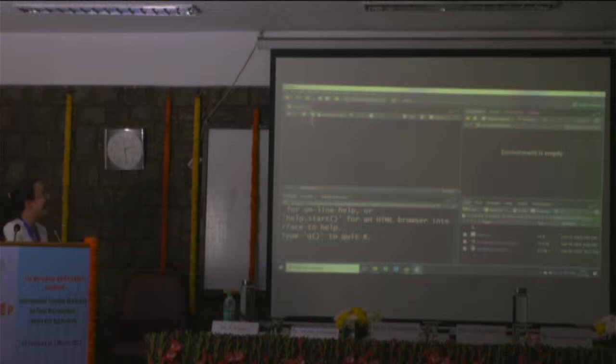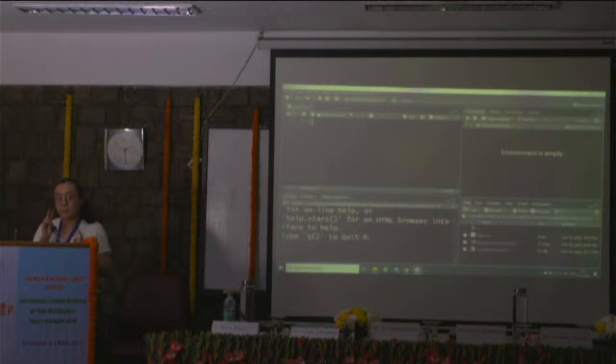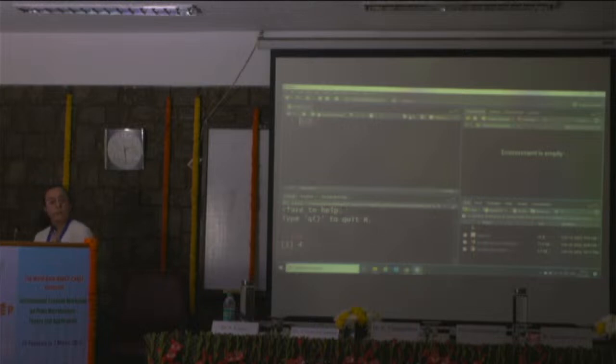Okay, good. So I have an expression right there. We know the result of that is 4, right? So it is there. I'm not executing it. It's just written. But as soon as I run it, it should appear over here in the console and also give me the result because it's executing it now. So whenever you have one line, the way to run it, there are 2 ways. You can either select all your line and click on run, and that's what is going to happen. So it prints again what you executed. It reminds you, you just did 2 plus 2, and then it gives you the result in white. So that is what the console is for.